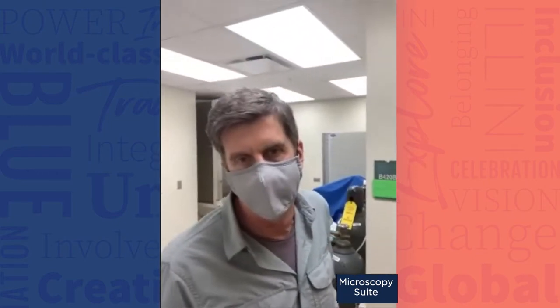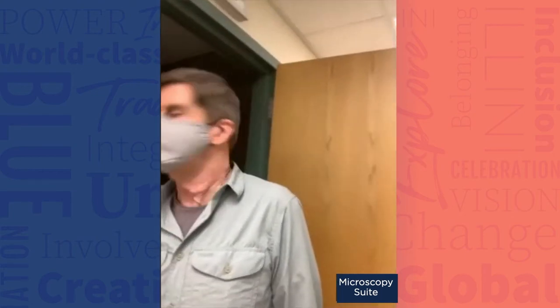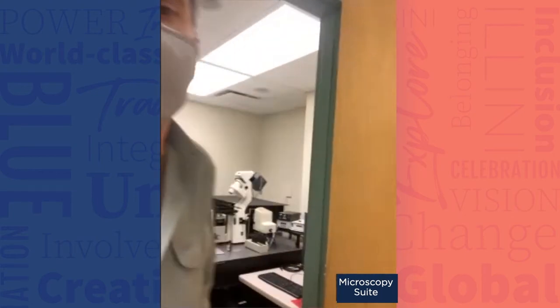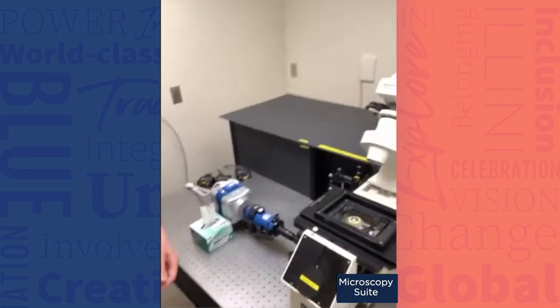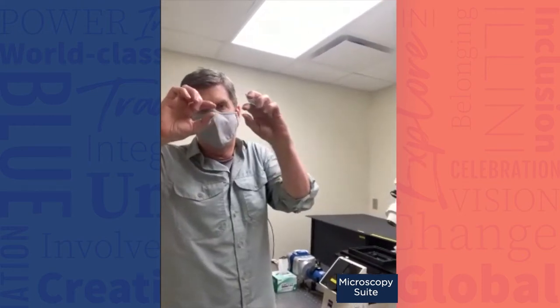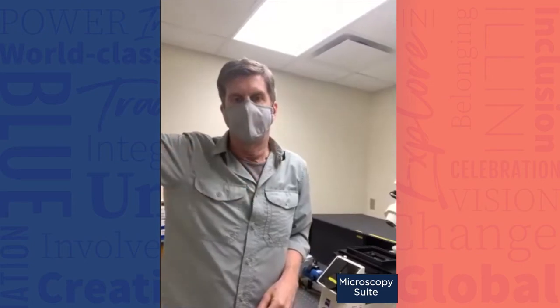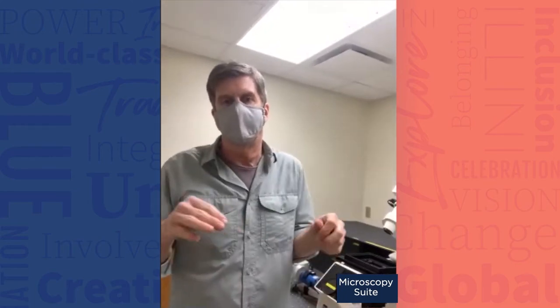This next room we're just going to buzz through quickly. This is where we're set up to do Förster resonant energy transfer imaging. It's also set up for TIRF — total internal reflectance fluorescence — and we have a super brilliant light microscopist/spectroscopist who built this. It's set up with lasers and does a beautiful job doing TIRF. TIRF is one of the super-resolution microscopy techniques where you get about 200 nanometers of super-resolution imaging, used for looking at membranes and things really close to the cell membrane, just through a super thin cover slip.